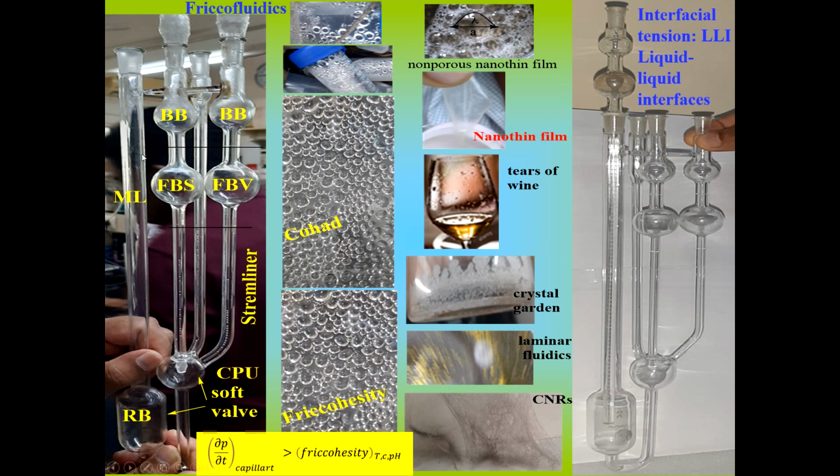See, this is a survismeter, and this is a reservoir bulb, RB, and this is the major limb. So the sample is transferred into this bulb, and this is the functional bulb for surface tension measurement. As I told you, there are two kinds of flows, continuum flow and non-continuum flow. This is cut off, it is in this environment, and now this is the viscosity unit, same instrument, and when the sample is lifted from this side, it works on the pressure gradient.